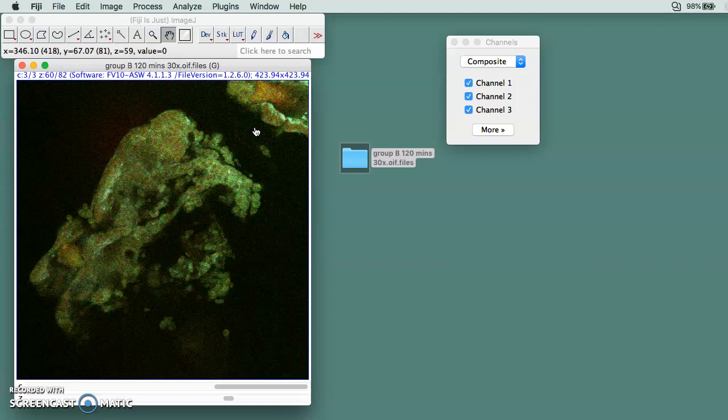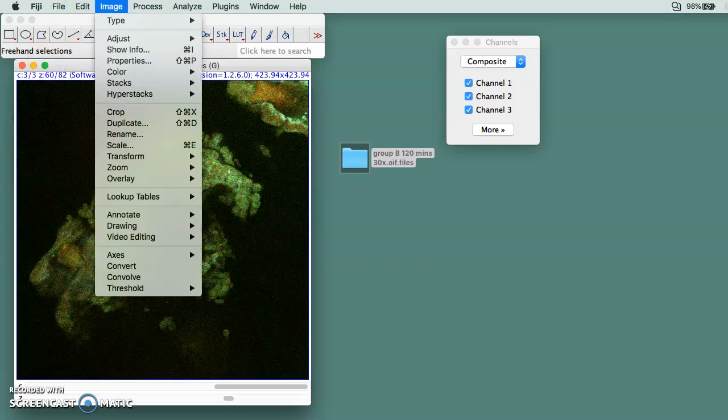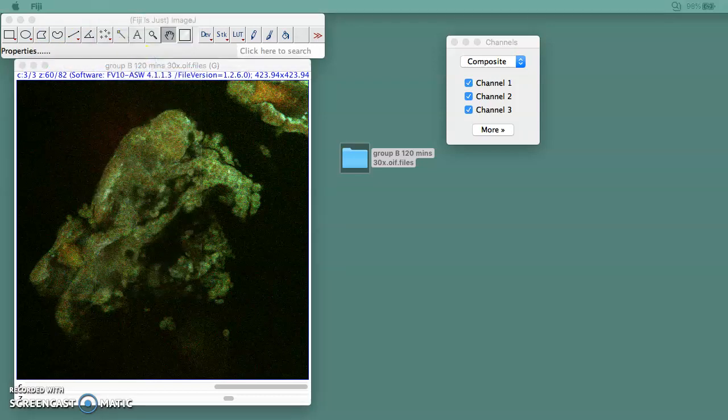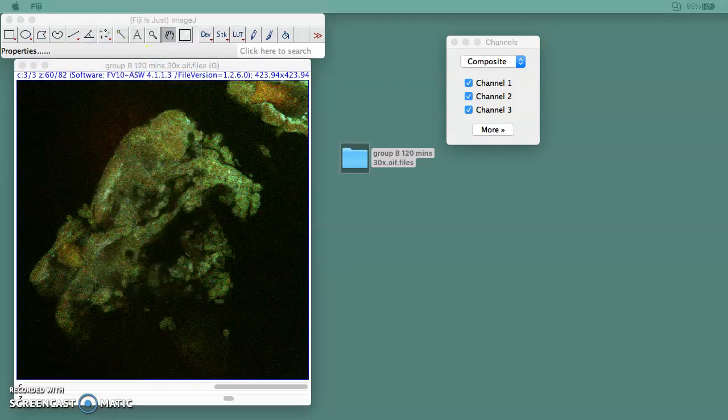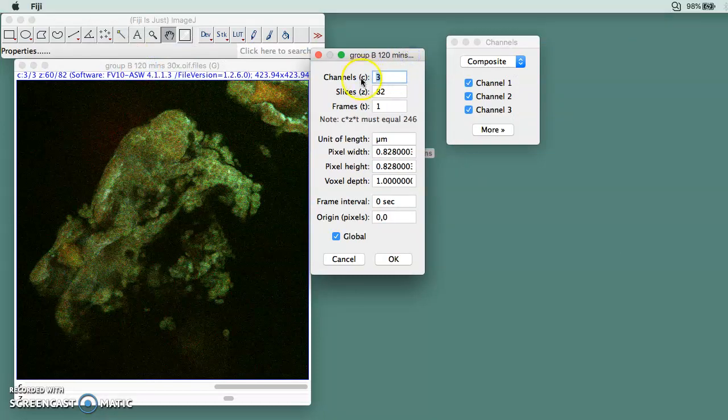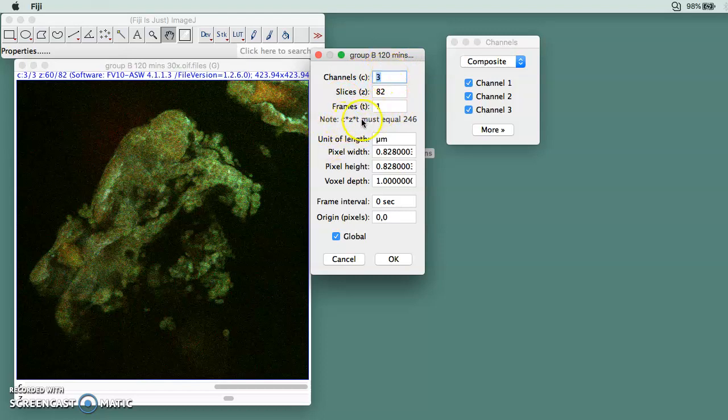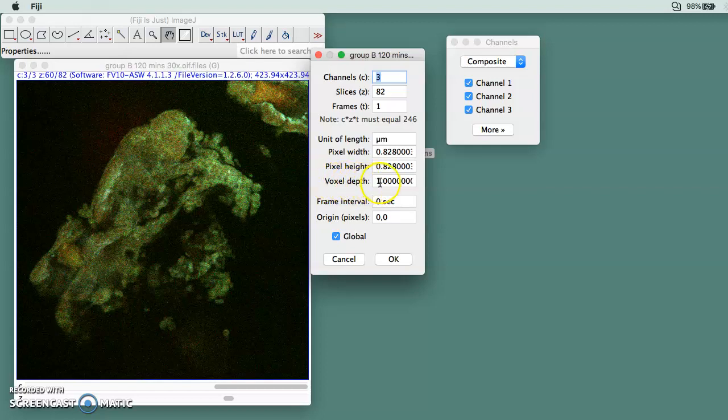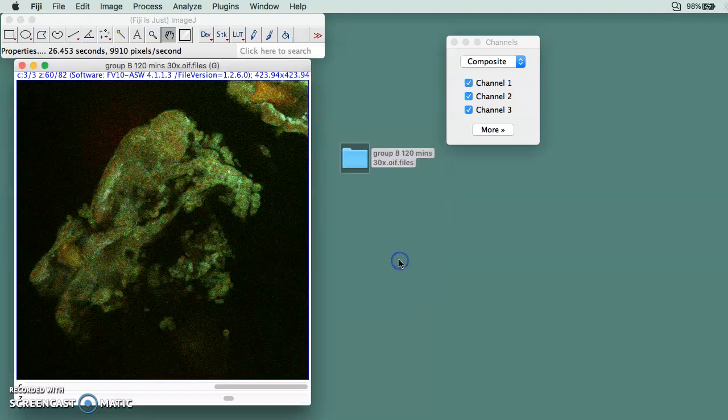Next thing you need to do is go to Image and then Properties. The channel size and frame we already corrected before. The frame is actually one, and you need to change the voxel depth to 1, and then you click OK.